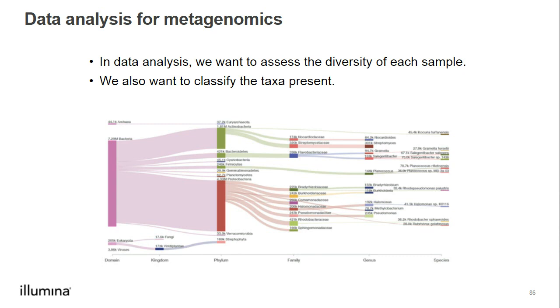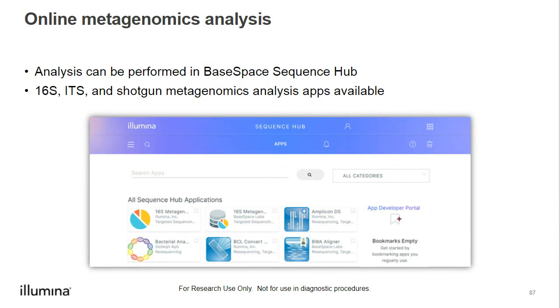For online data analysis, we can head to BaseSpace Sequence Hub. You can store run information, generate FASTQ files, and perform downstream data analysis all in BaseSpace. For analysis workflows, we can select the Apps option, which will be near the top of the page once we sign into our account.